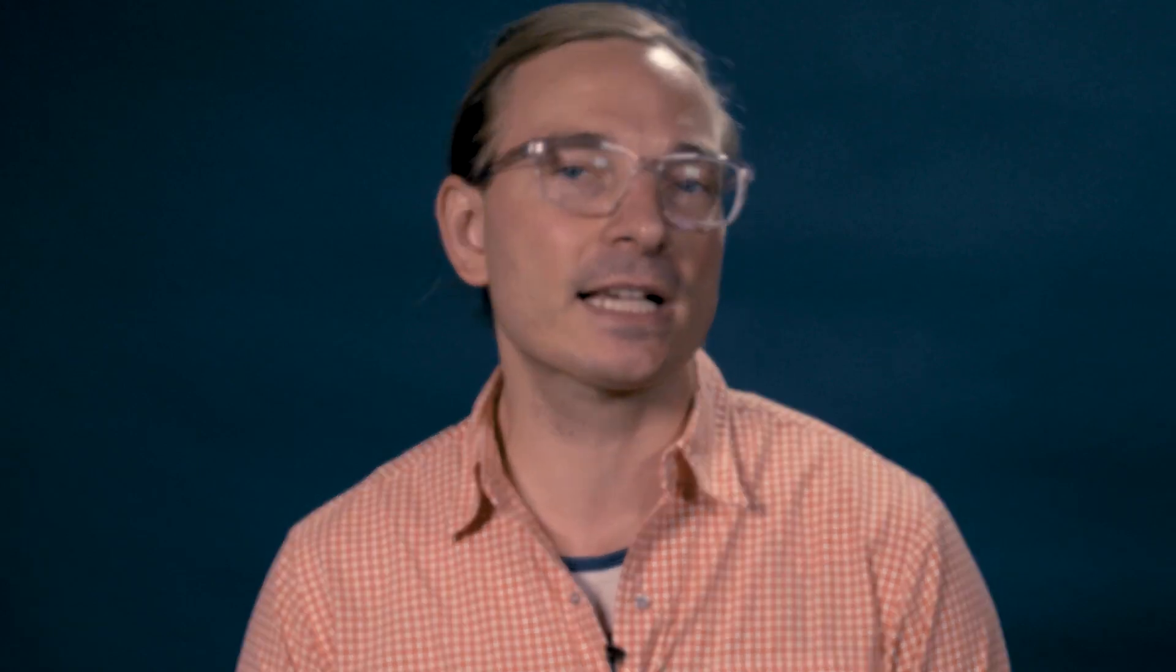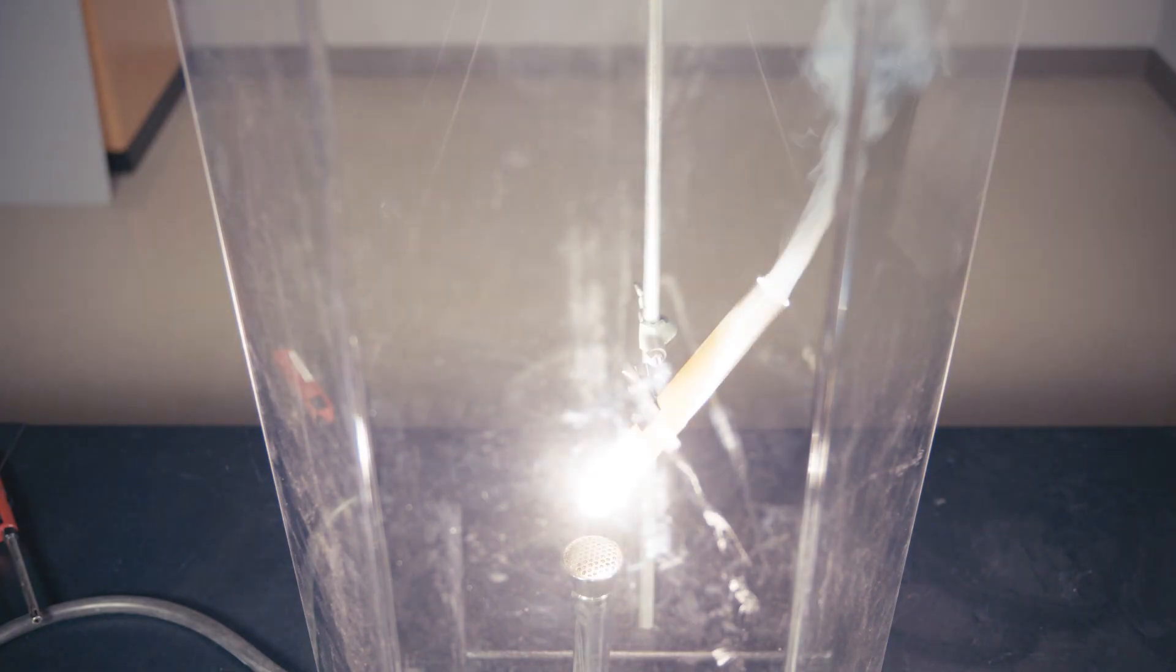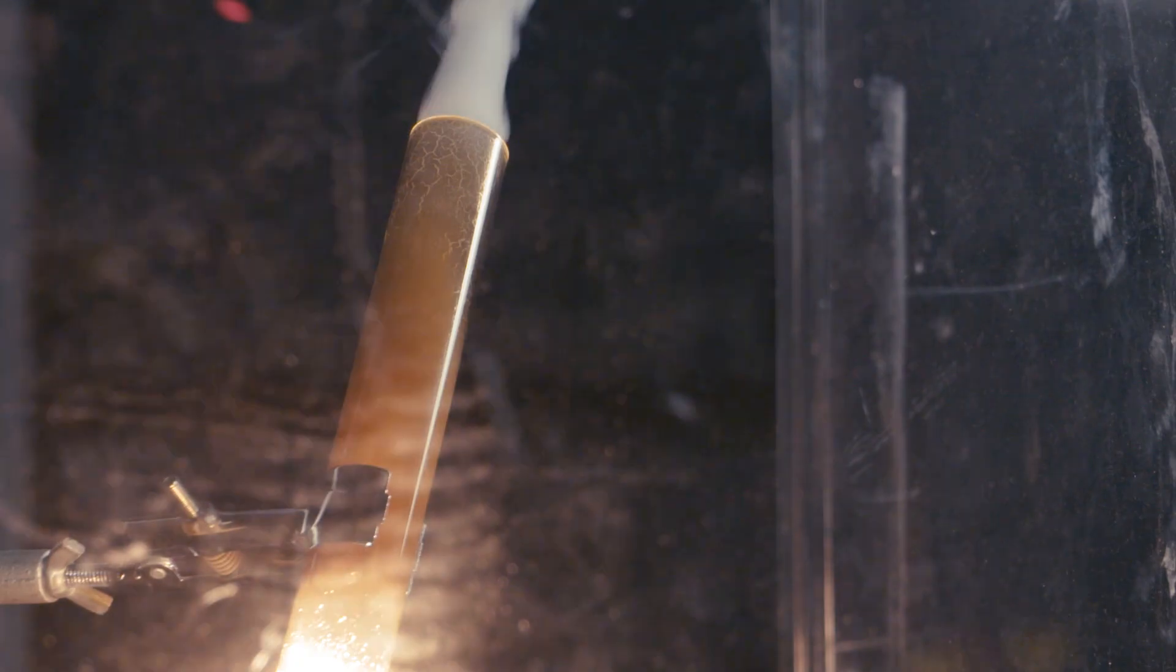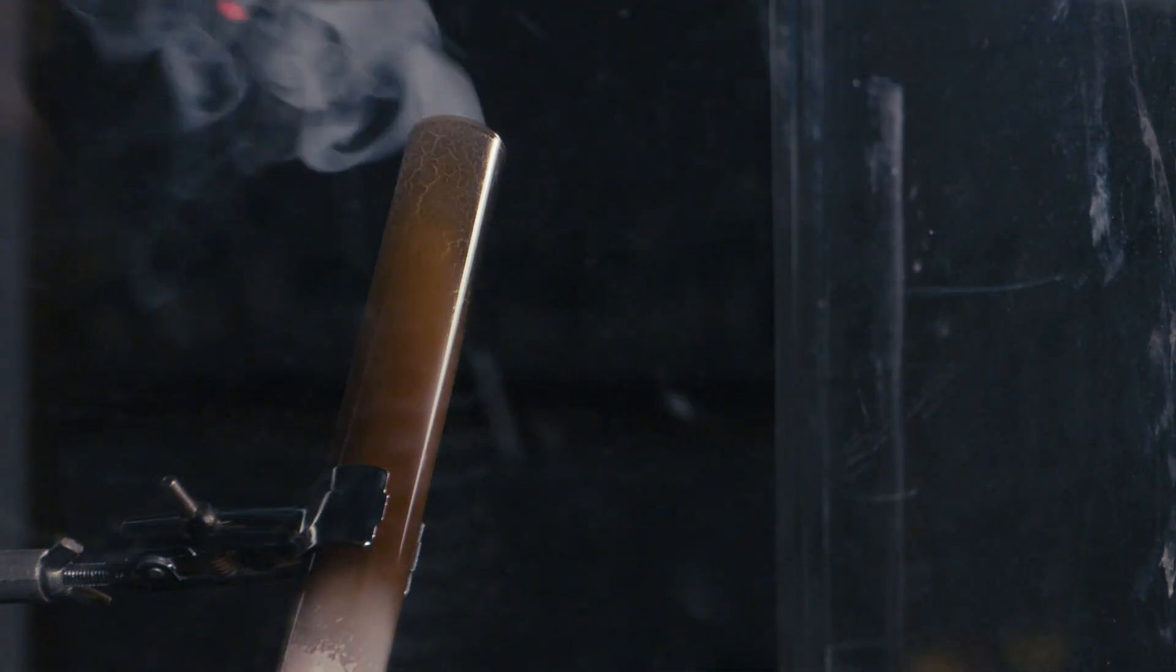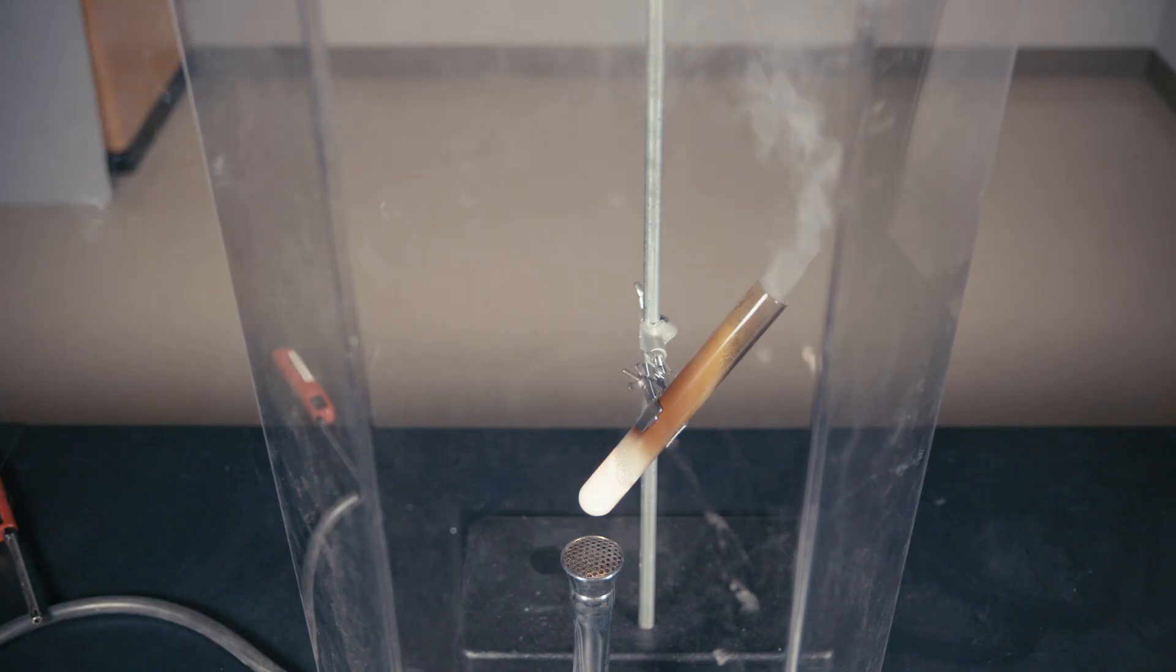And because this reaction is a combustion reaction, it is highly exothermic, meaning heat is the byproduct of the reaction, along with burned sugar in a completely fine and working combustion tube that is now trash. Unless you want to clean that out, which I do not. It's going in the trash.